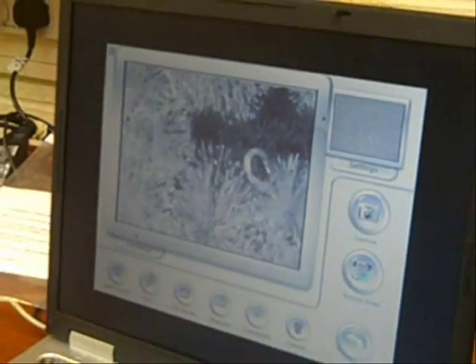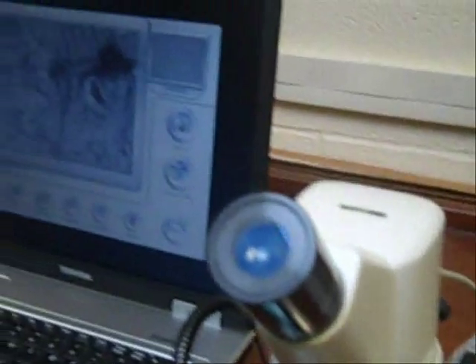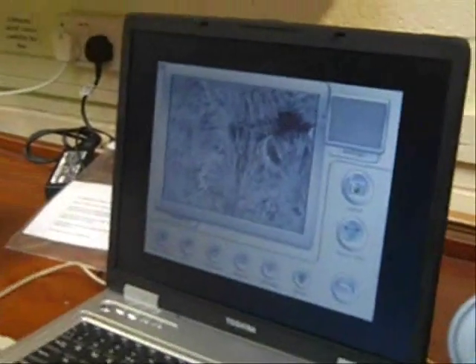They're really beautiful. You can get the crystals growing slower if you use hotter water in your beaker to begin with. That's a really good way to introduce crystallization to key stage three.